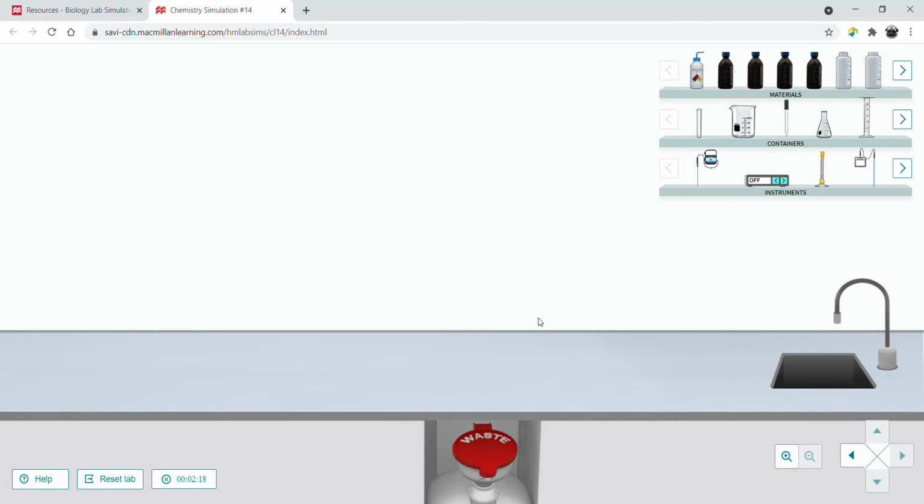It is your instructor, Karen Klein, and as before, we are together here to accomplish a lab. Today's lab is on enzymes and how enzymes work, and how a specific enzyme works under 3 different pH environments.